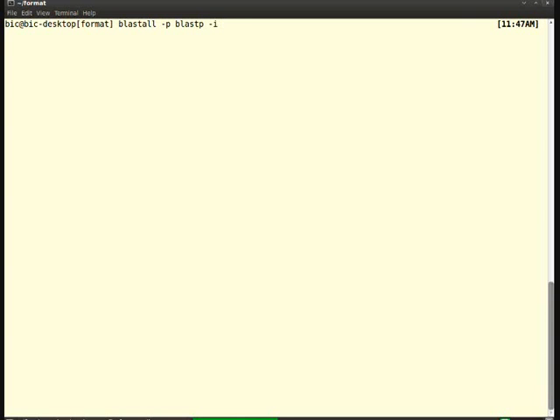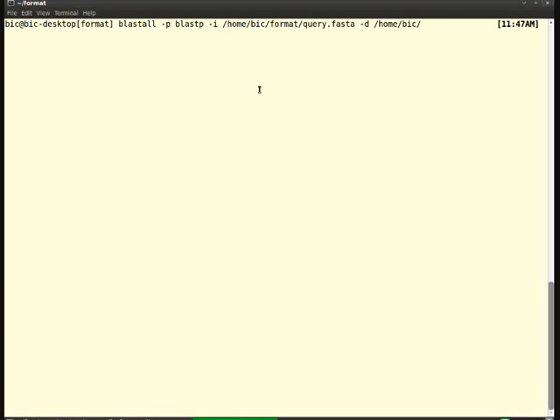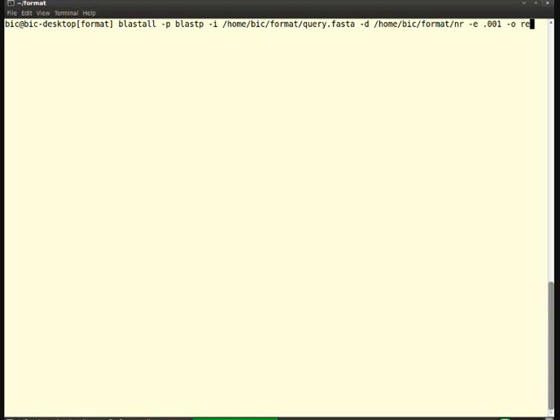And hyphen i stands for the input file, and the input file should follow the path name of your query file. So my query is in the folder format and that name I have given as query.fasta. It should follow hyphen d, that stands for database, and it also should follow the path name for database, format and nr. Then it should follow the e-value. The expected value will determine the outlier. I have given hyphen o to get my desired output, and I'm giving the output file name as result.out. Let's run the program. Yeah, it's completed.